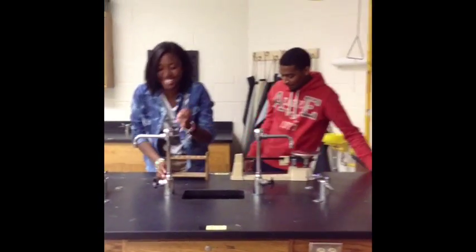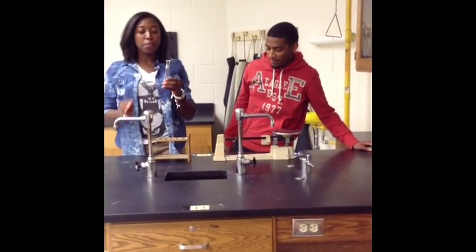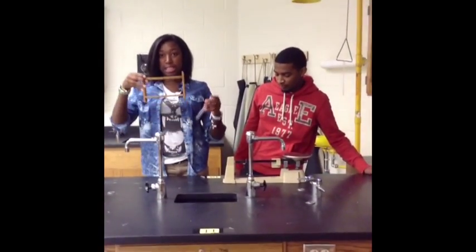This is a test tube. You use it to pour different solutions into, and you can examine it. And you put it into the test tube rack.